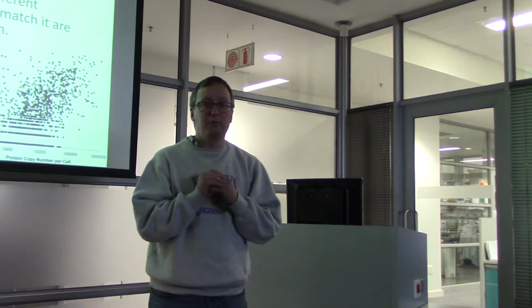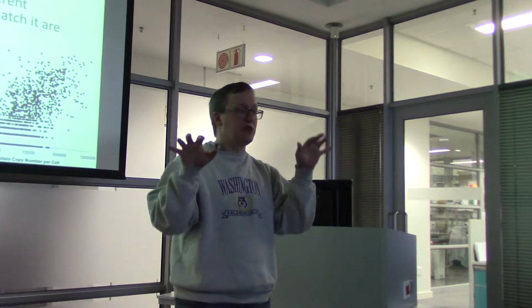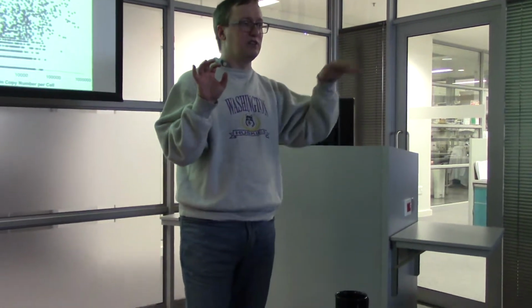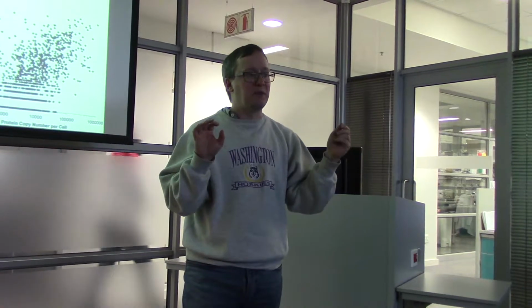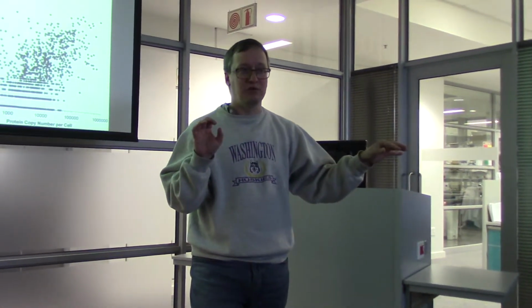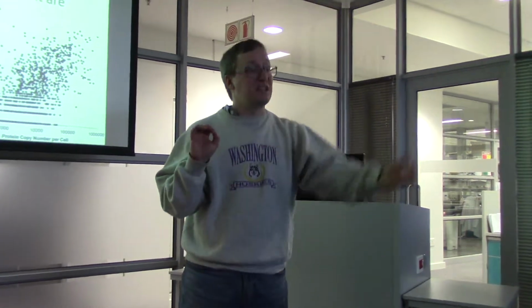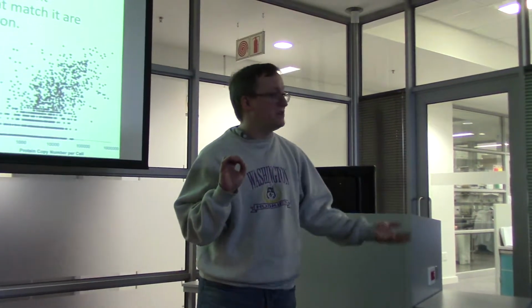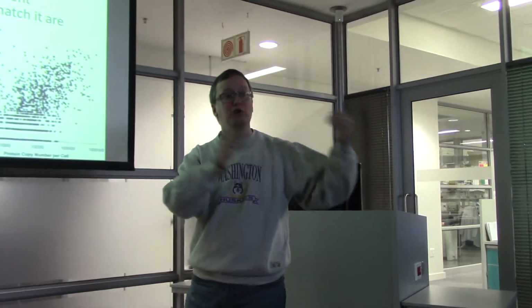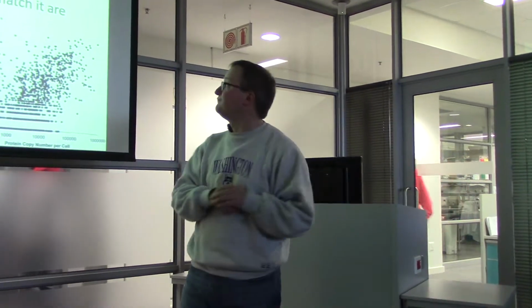So, if you have a protein that changes in concentration between two similar backgrounds, you would expect that when that protein is more concentrated relative to the mean, it's going to get more attention from the mass spec, which is to say more peptides are going to be analyzed from that protein. More tandem mass spectra will be produced for their peptides for that protein. So more concentrated proteins will in effect match to larger numbers of tandem mass spectra.